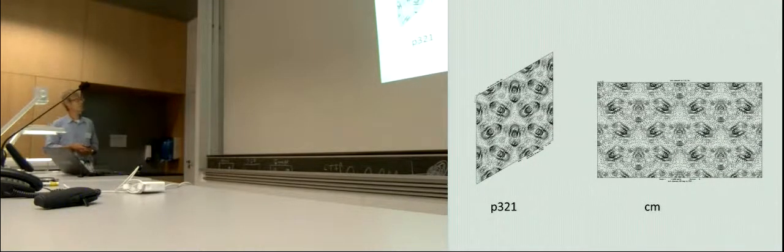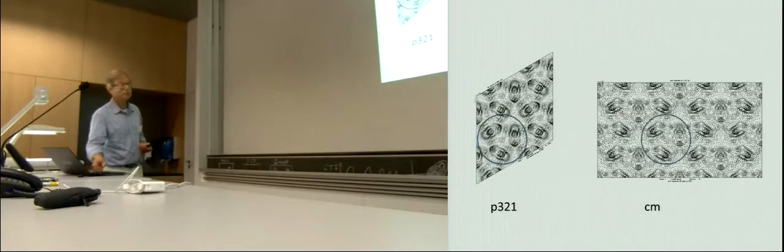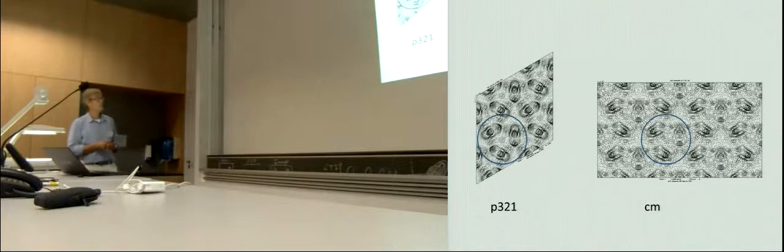lattice in this case? So these are projection maps now calculated in both symmetries, and you can see that we have a similar unit here of three proteins. So in the P321 case, there will be a perfect 3-fold symmetry here. In this position, they would look identical.